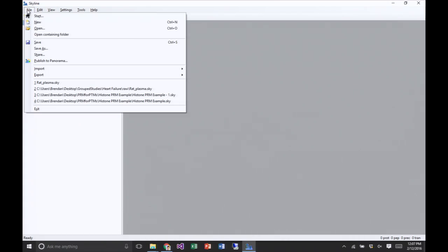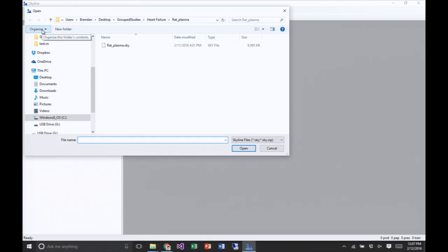So I'm going to go to File, Open, and on my desktop I've got iPRG, and this is the file.